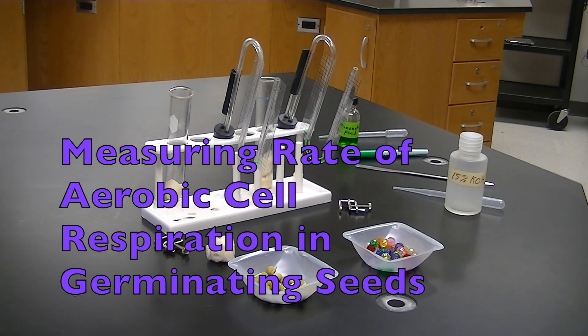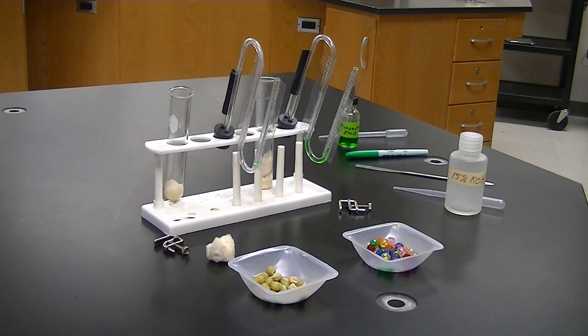Hello, this is Mr. Hagey and today I'm going to show you the setup and procedures for measuring the aerobic cell respiration rate in germinating peas.